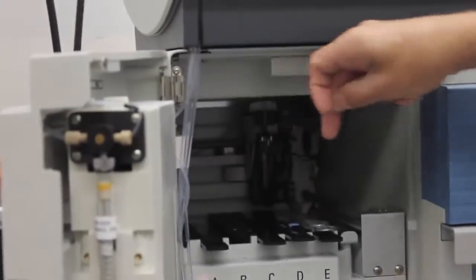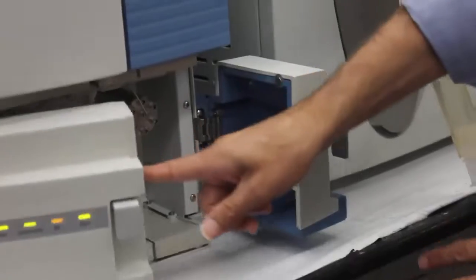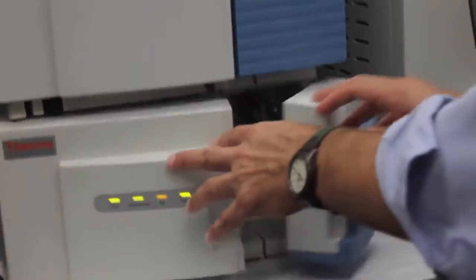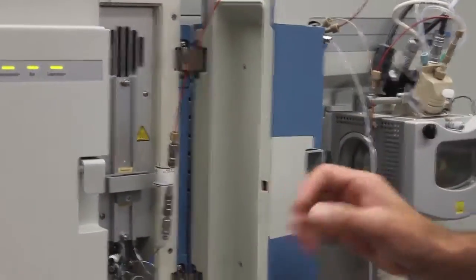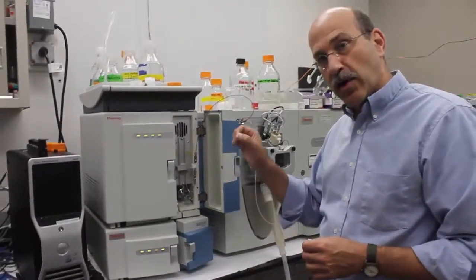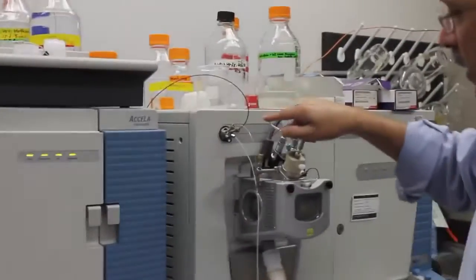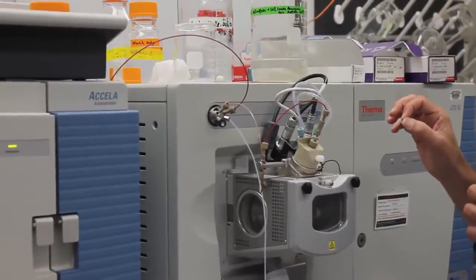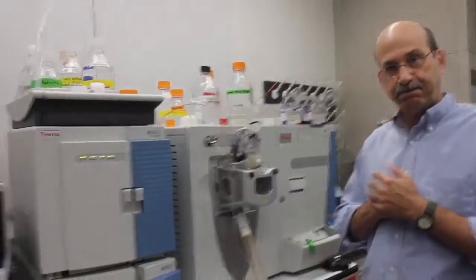This is an auto-sampler. The robot will go over and pick up a sample, select it, and put it into an injector. The injector will run it through a micro column, and then it will go through a separation column here, which separates the analytes. The affinity for the solid phase material is what causes one analyte to stay on column longer than another analyte. After it goes to that column and is separated, each one of these is analyzed by an ion trap mass spectrometer, the same kind of mass spectrometer that I showed you with the GCMS.